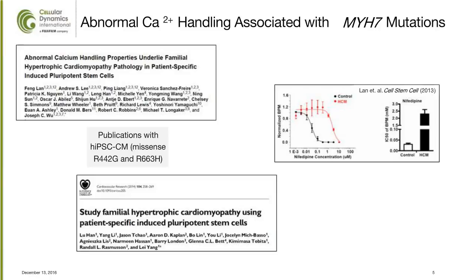We wanted to look a little more closely at the effect of calcium channel block on irregular beating as well as the effects of mechanical overload.